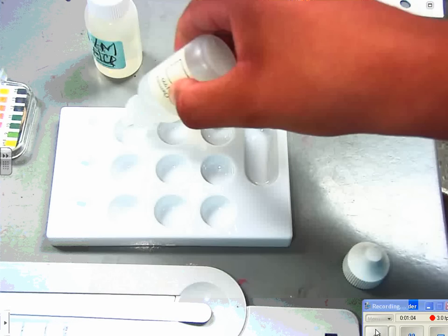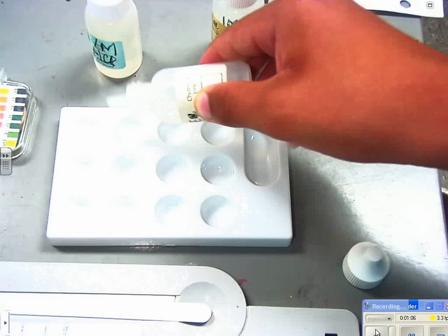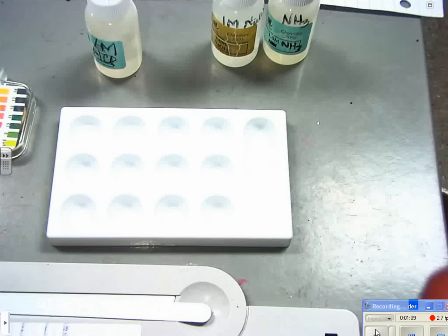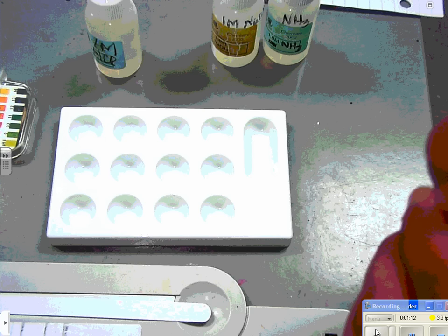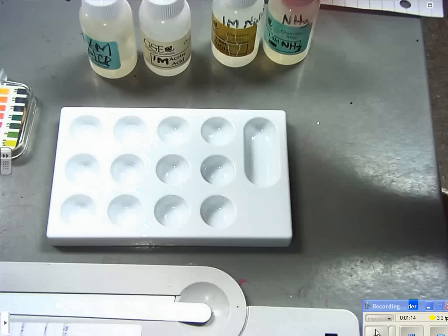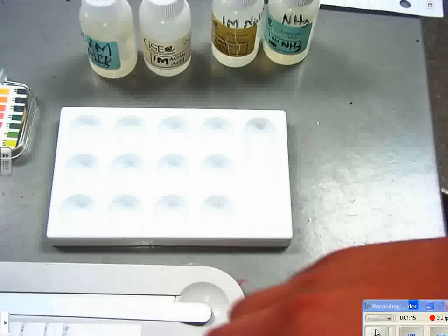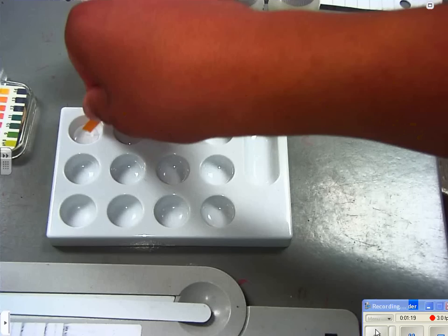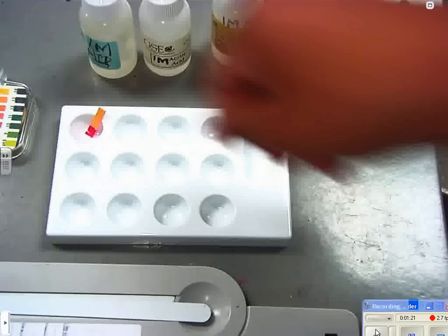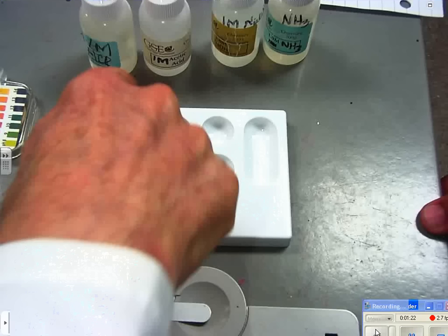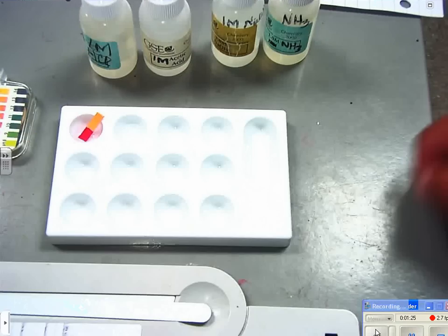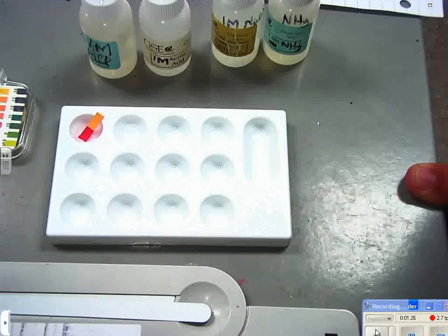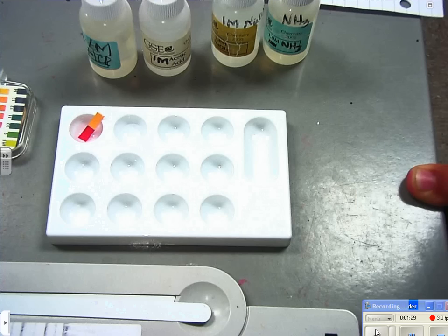Next you have to test the pH. You're gonna put the pH paper in there. Now you want to make this go down and read it immediately, don't wait. It's two, wait, one. The pH is one.